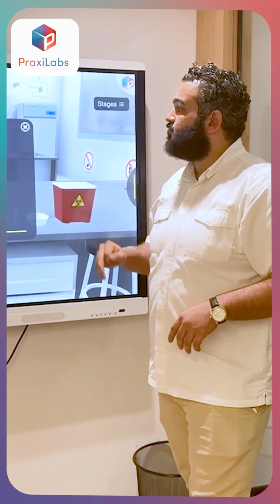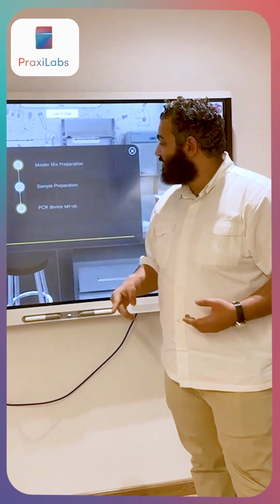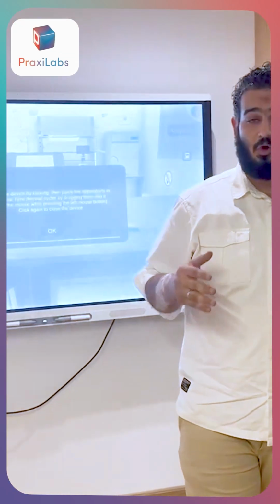There are many steps to complete and prepare the master mix, but I will show you another feature in the lab. Here in the stage button, you can move between the stages like that, from the master mix preparation to the PCR device step. So if you master the whole experiment but need to teach the device part to your students, you can do it like that.